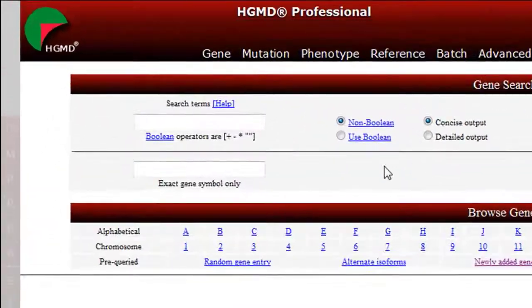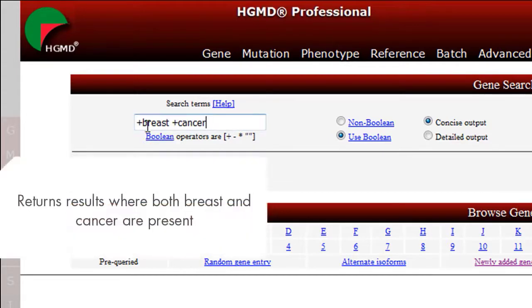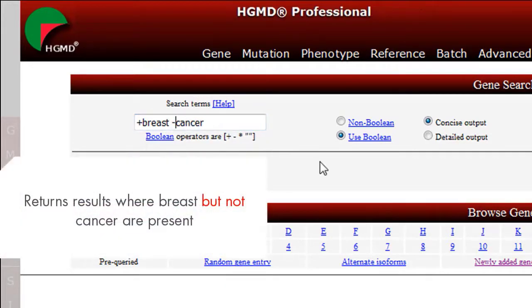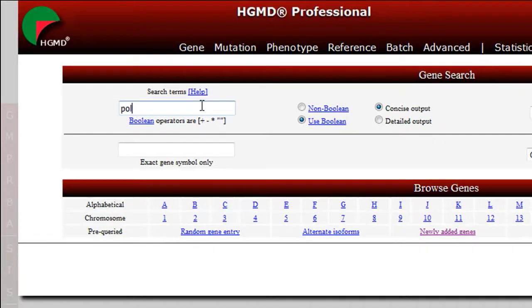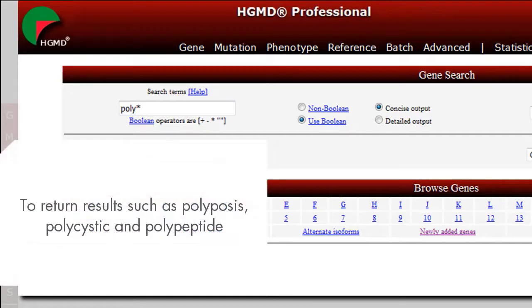The Boolean operators are helpful in cases where you want to search by a very specific query. For example, the search term plus breast plus cancer returns results where both breast and cancer are present, while the search term plus breast minus cancer returns results where breast but not cancer are present. Alternatively, use a wildcard like POLY* to return results such as polyposis, polycystic, and polypeptide.